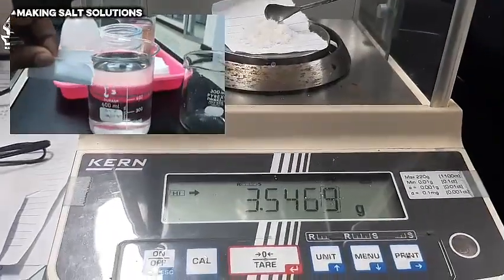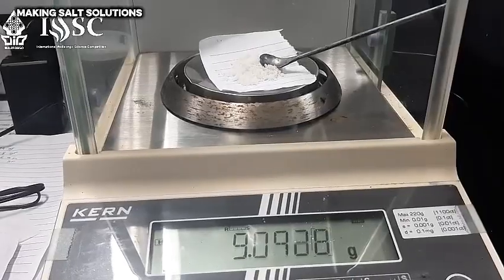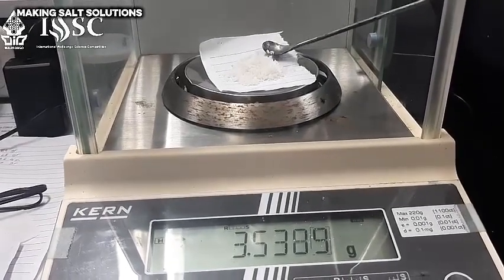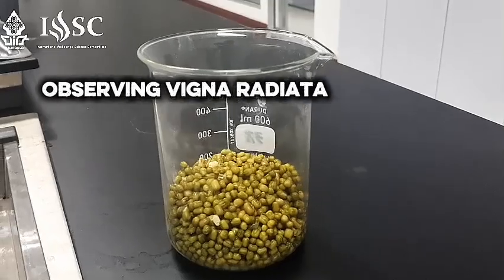Finally, mix 3.5 gram of sodium chloride solids with 600 milliliter water in the glass beaker to make 0.1 molar sodium chloride solution. And then observing Vigna radiata.